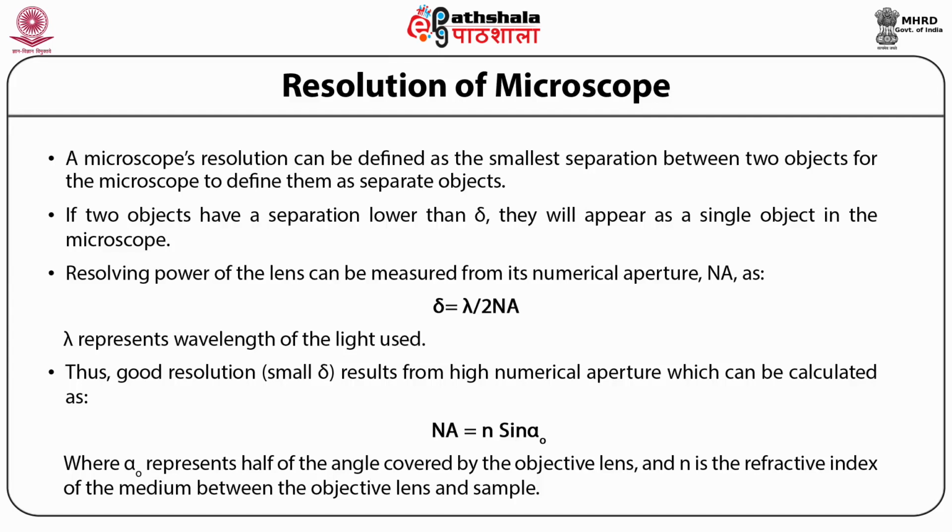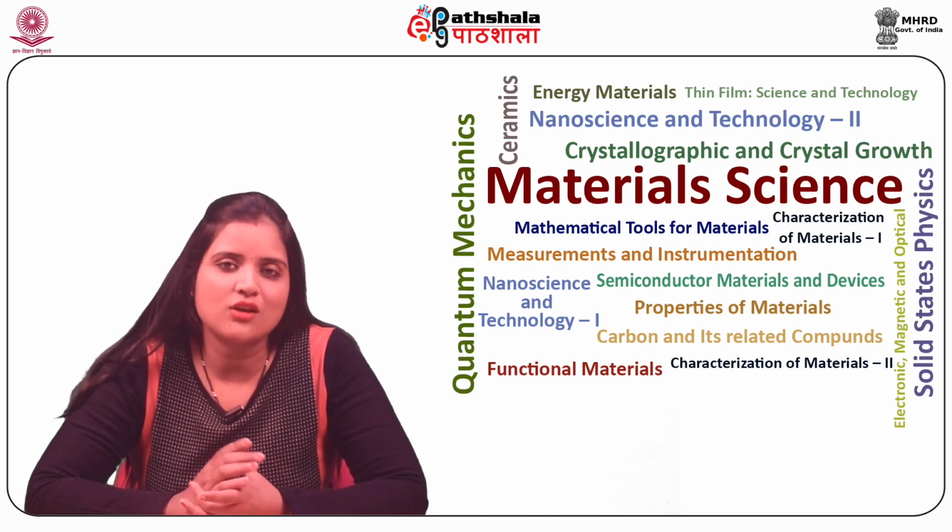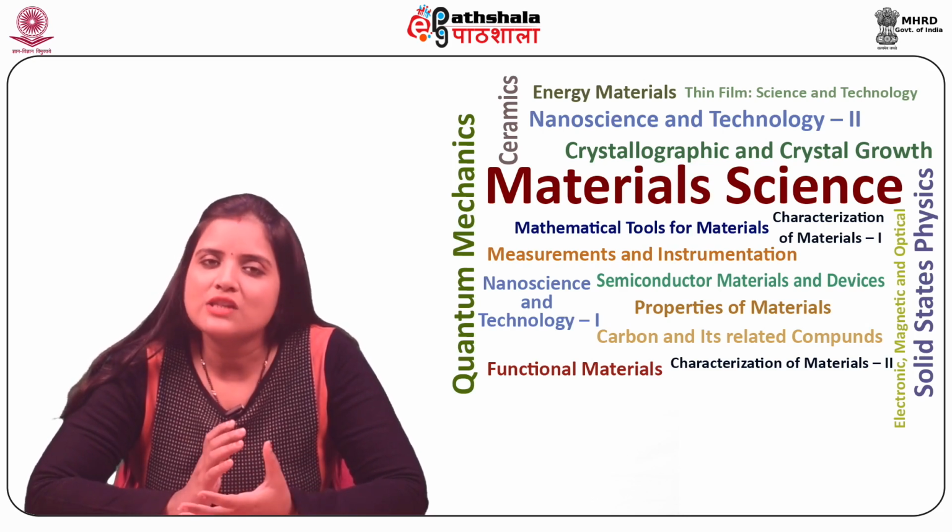Therefore, if the gap between lens and the sample is filled with oil, the numerical aperture can have values greater than unity, as oil has a refractive index greater than 1. Let us now study the properties of immersion oil.